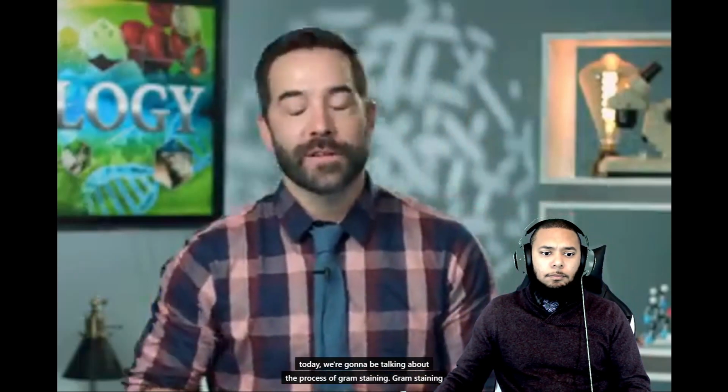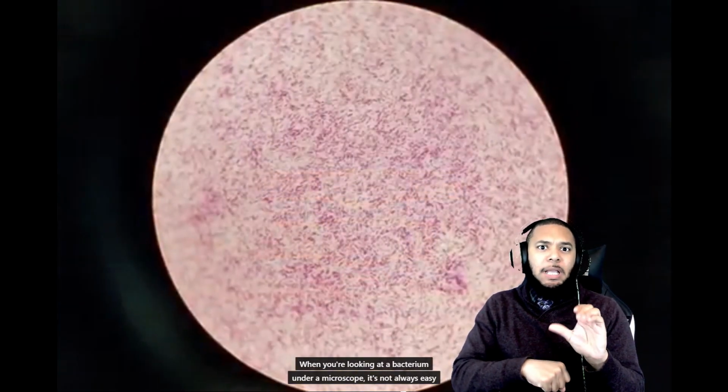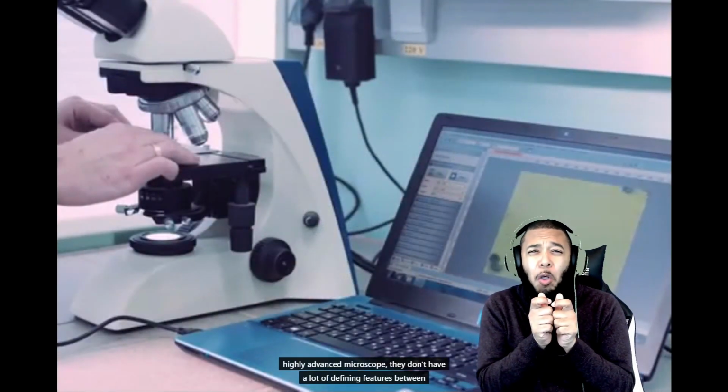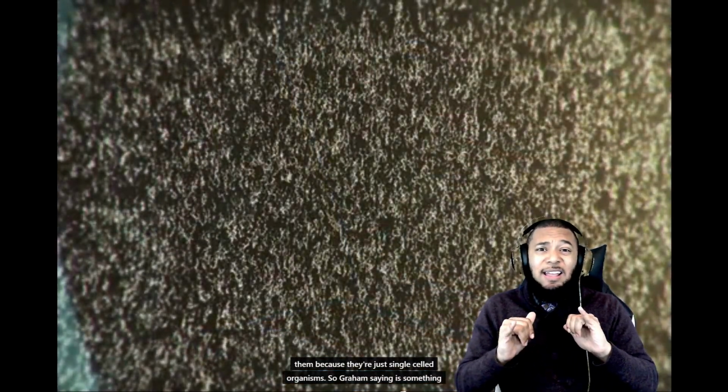Today we're going to be talking about the process of gram staining. Gram staining is a technique that we use, especially in microbiology, to identify bacteria. When you're looking at a bacterium under a microscope, it's not always easy to tell what you're looking at. They're incredibly small, and even using a highly advanced microscope, they don't have a lot of defining features between them because they're just single-celled organisms.